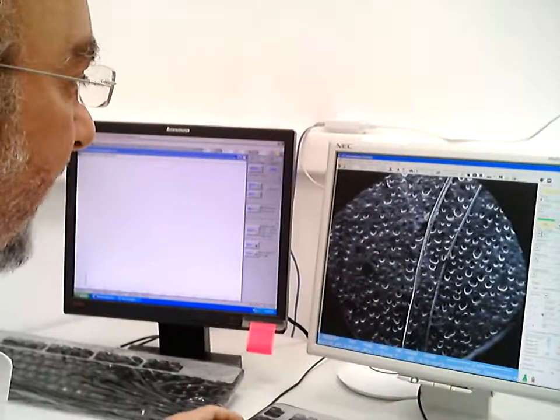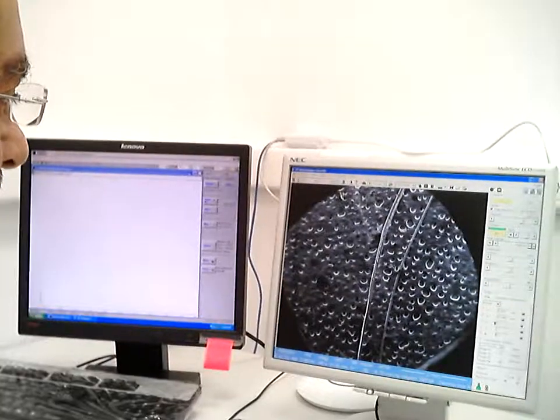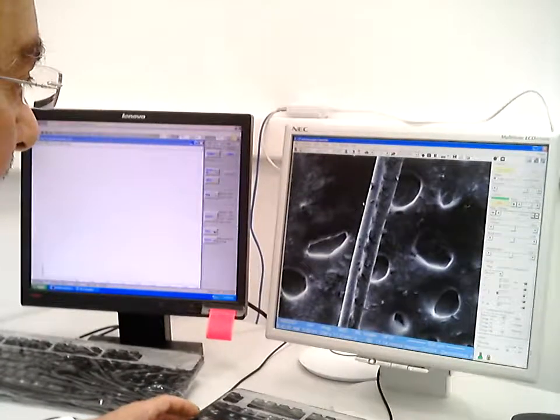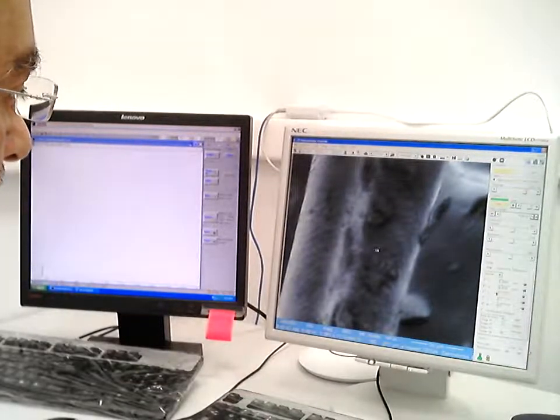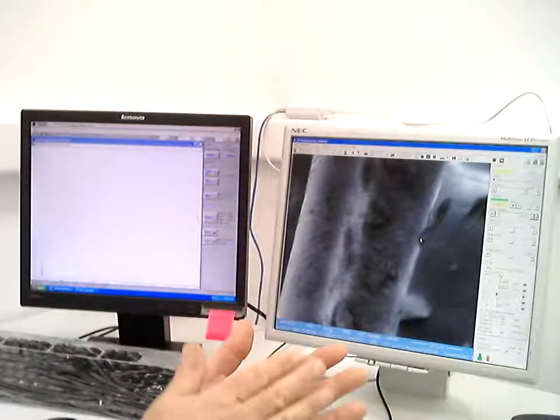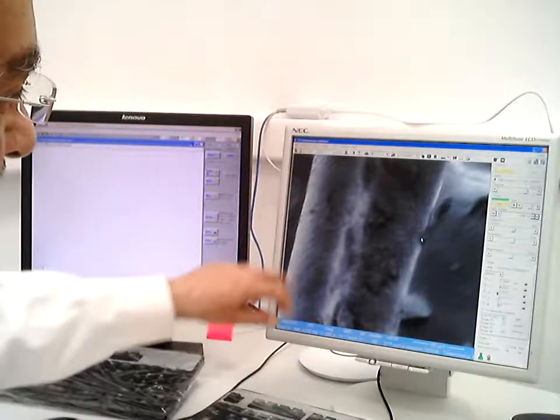This is actually a human hair, and if you go to high enough magnification, it has particular striations. You can see that this human hair consists of scales on top of one another. This is a double hair, which is very interesting.